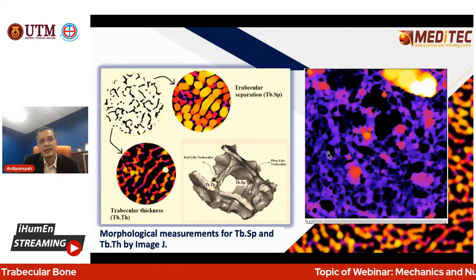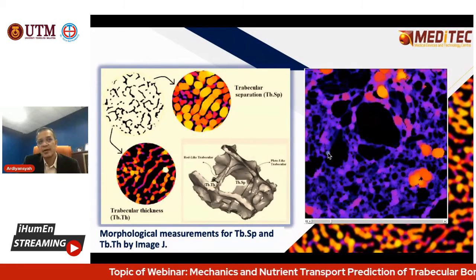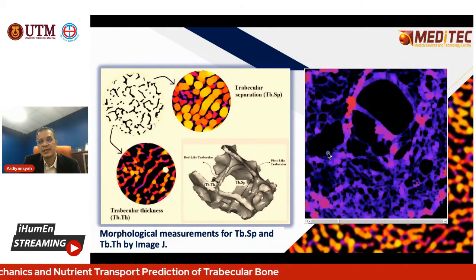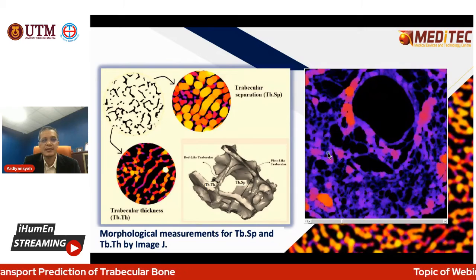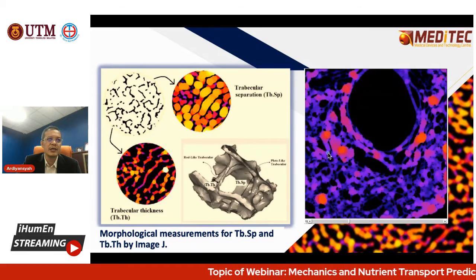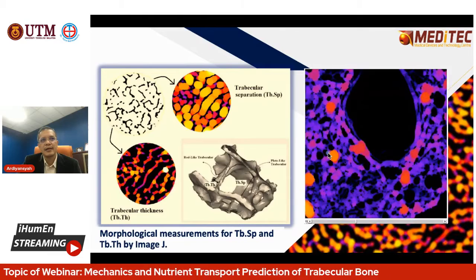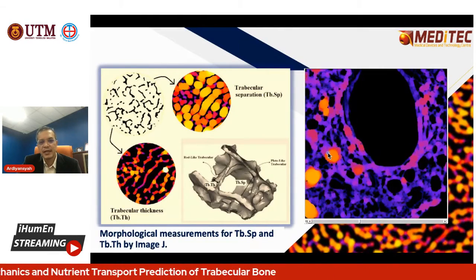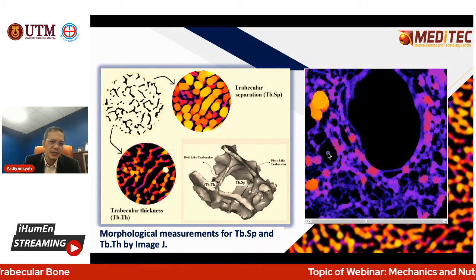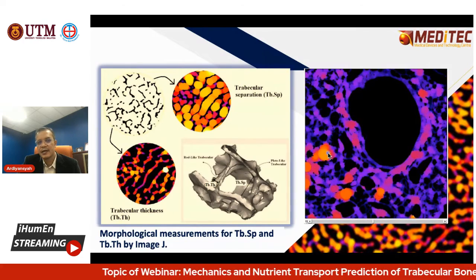After the slicing and the scan, you can have 1,000 slices of cancellous bone. The diameter, let's say, is 8 or 10 millimeters and the length is 12 millimeters. You can construct more than 1,000 slices. Then you can study the morphology of the cancellous bone, and identify its properties in terms of the mechanics and the fluid mechanics in the cancellous bone.